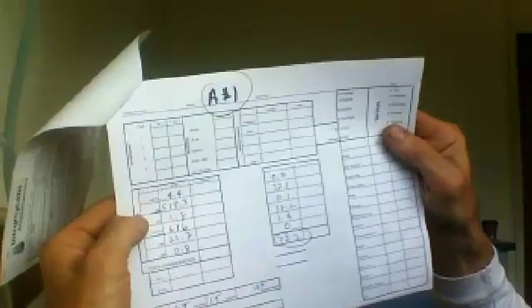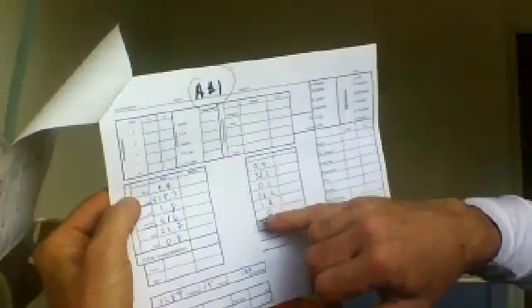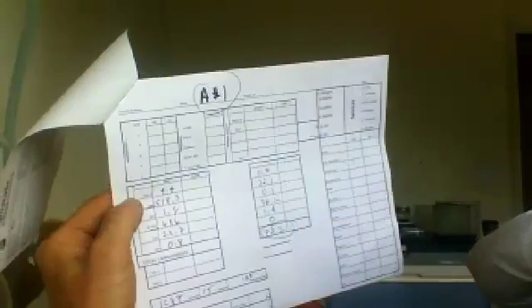Hey guys, how are you? Okay, I'm going to show you the results now. This is A1. A1 was, let's have a look, 32.1 CBD. CBC was 0.1, very small amounts.